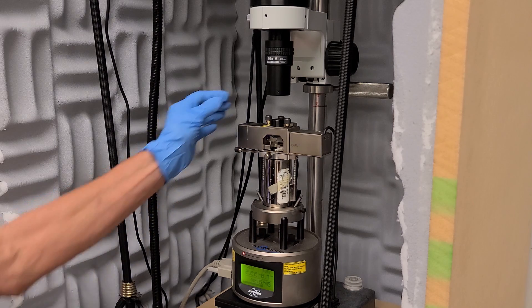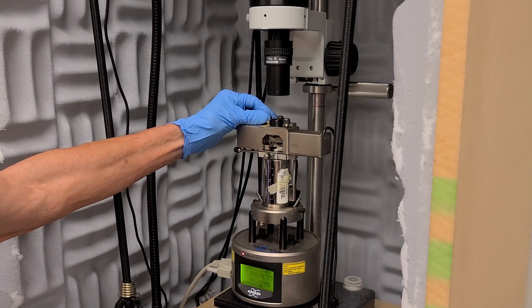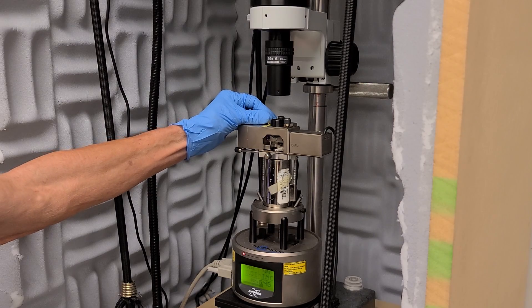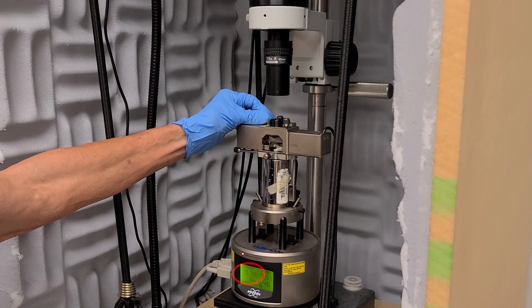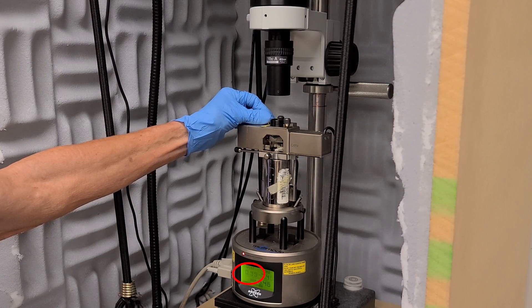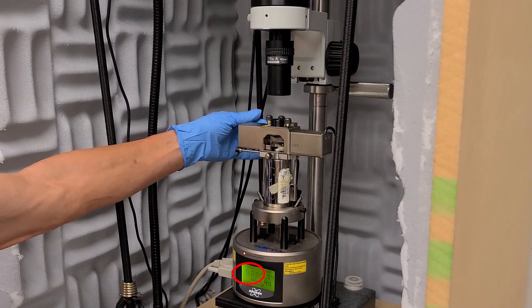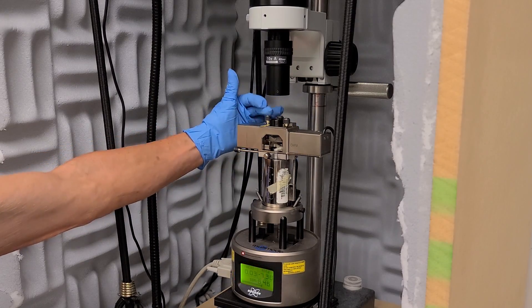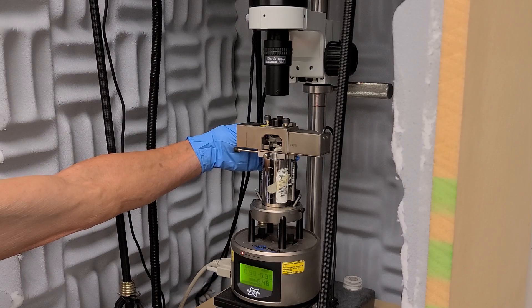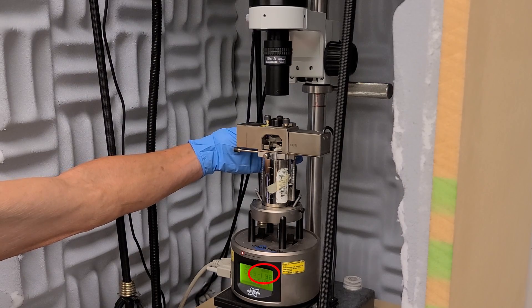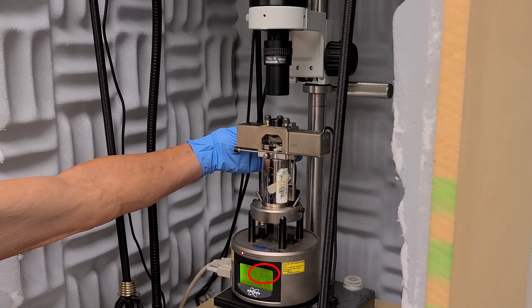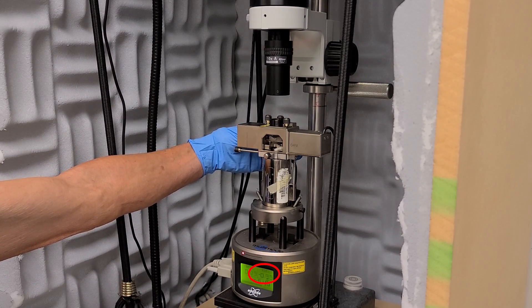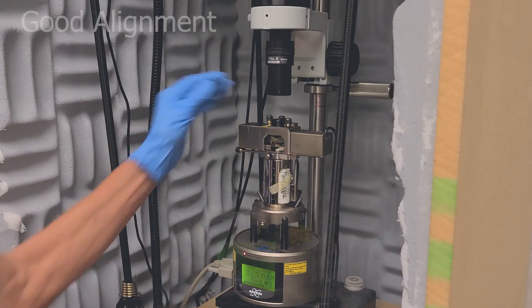To align the laser reflection to the center of the position sensitive detector or PSD, turn the vertical knob at the top left of the optical head until vertical value reaches 0 plus or minus 0.2. At the back left of the optical head, turn the horizontal knob until the horizontal value reaches 0 plus or minus 0.2. The alignment is now complete.